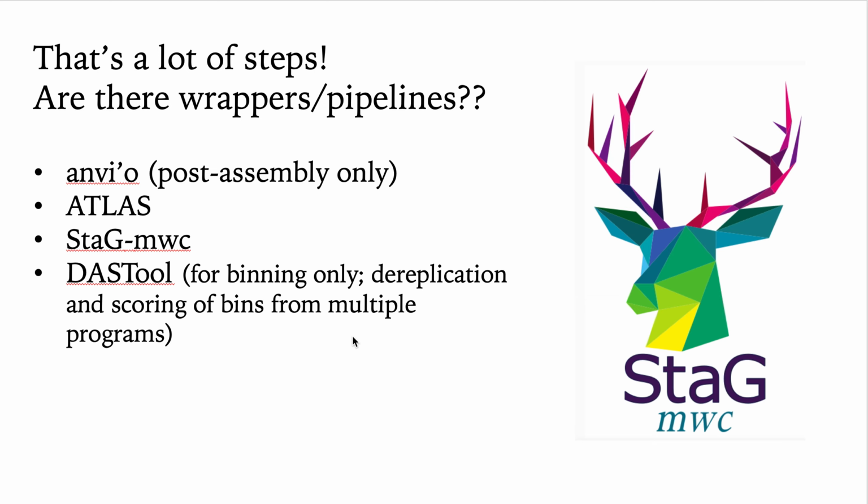Anvi'o is a very common and very powerful pipeline that works post-assembly. So once you have your reads assembled into contigs, you can feed those into Anvi'o and run a series of steps that will get you through the binning and annotation process. I don't like to bin with Anvi'o either, personally, but it does give you that option if you choose. Atlas and this other one called STAG, I'm not familiar with them, but I believe they're Snakemake pipelines that will run through assembly all the way through binning.